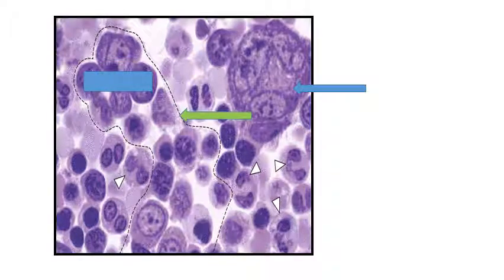Okay, so what is this? Well, that's probably going to be megakaryocyte. It's pretty big. It's not usually a conglomeration of cells, it's just one big cell. Now, what about here? Well, if I told you that all of this area was a blood island for erythropoiesis, you would see that these cells are kind of all linked together in this red area, and this is where we're going to have our erythropoiesis.